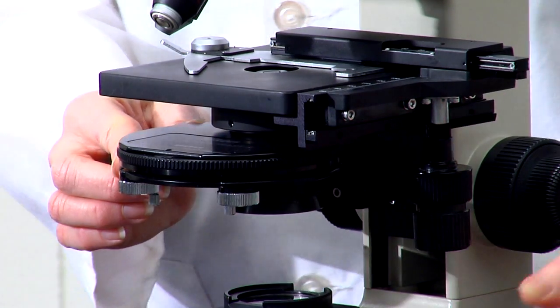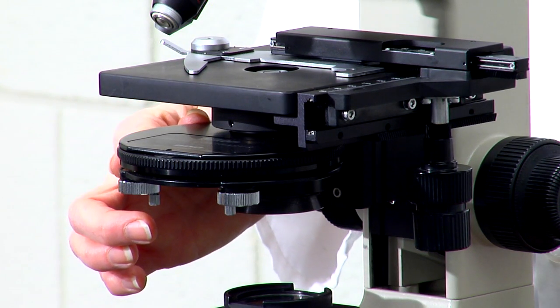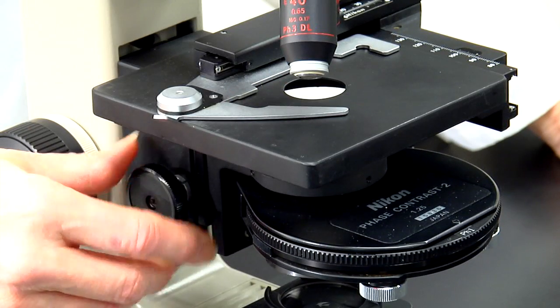The light is focused onto the object, and the object is magnified by the objective lens. Notice the condenser lens system can be adjusted up or down with the knob on the side of the microscope.